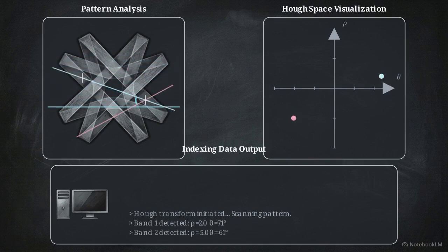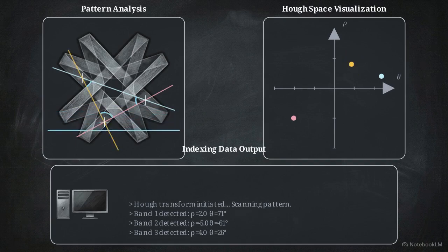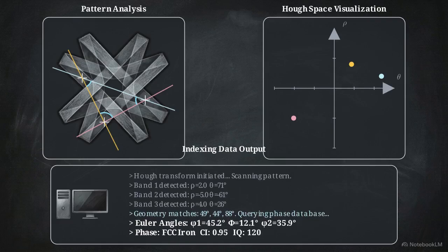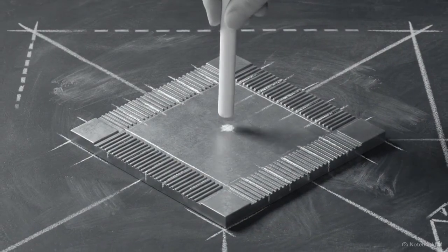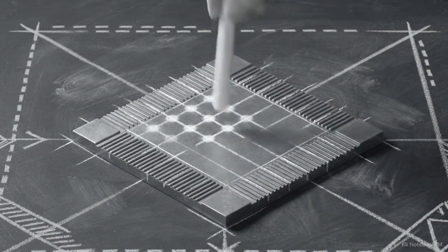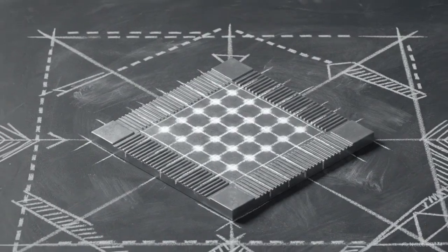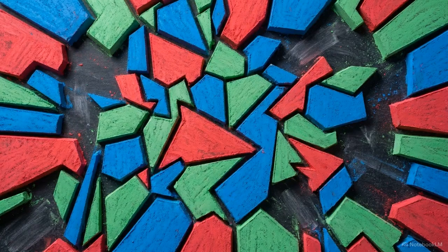This entire physical and computational cycle repeats rapidly at thousands upon thousands of precise points. The resulting map represents millions of subatomic scattering events converted into light and indexed via the Hough transform. Extracting usable microstructural data demands strict mechanical and physical calibration across the entire hardware chain. At the macroscopic level, you must understand the SEM electron optics and maintain precise control over the incident beam.